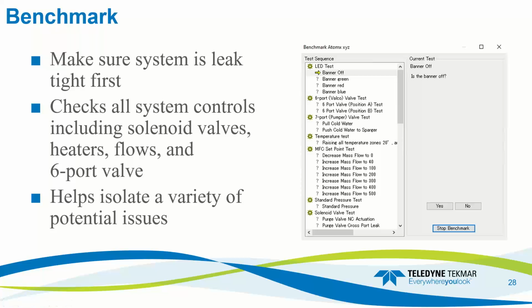And the benchmark test is also a great troubleshooting tool. Like I said before, you just want to make sure that your system is leak tight before you start it. It checks all the system controls, including solenoid valves, heaters, flows, the 6-port valve, and it helps isolate a variety of potential issues that you might have and helps determine what might need to be replaced.